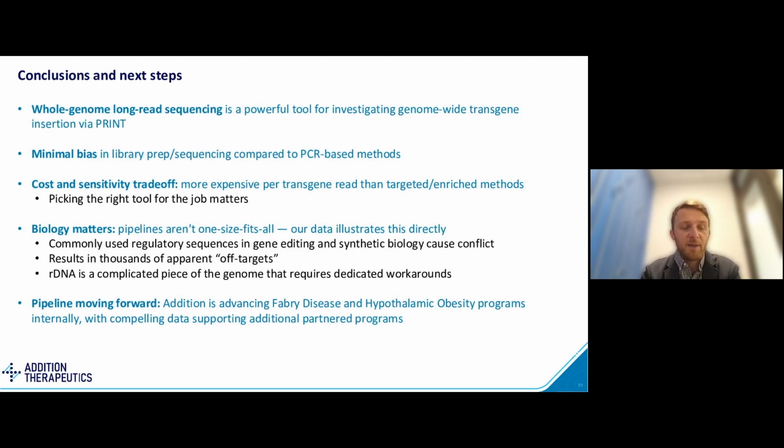Furthermore, the rDNA specifically is a complicated piece of the genome, and it really requires some dedicated workarounds to be successful in its mapping and its processing. And as sequencing technologies improve, hopefully that will improve as well.